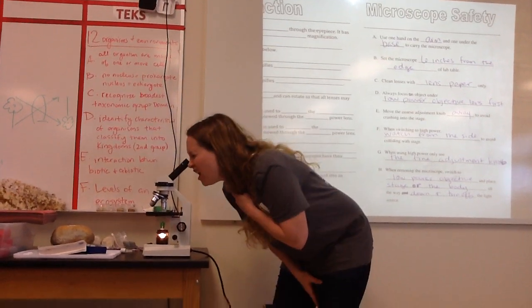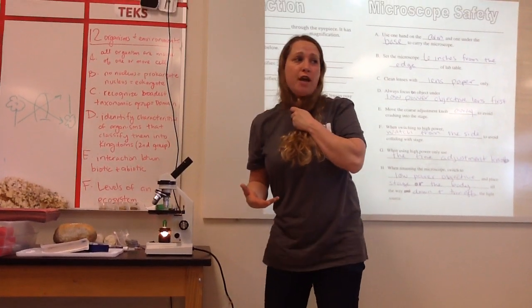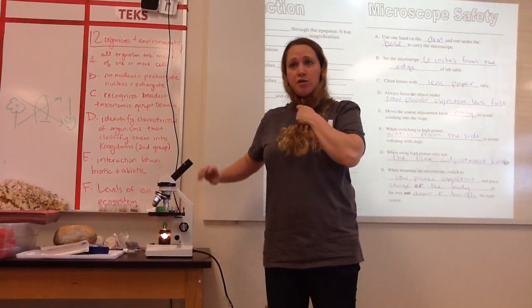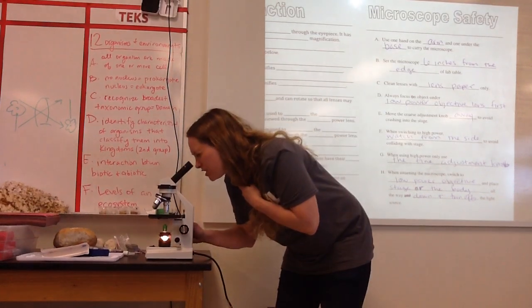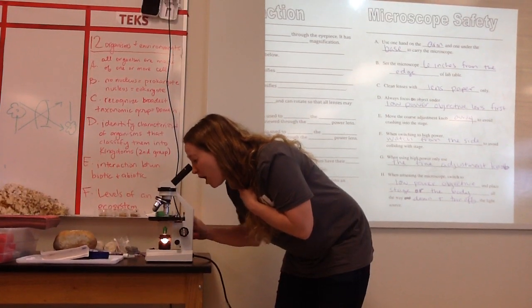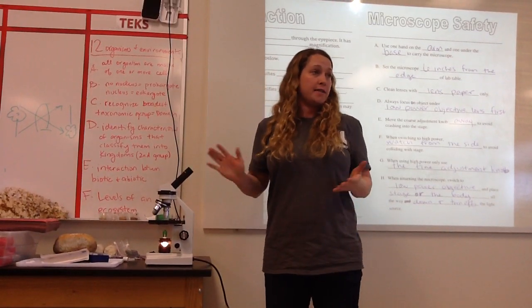So I put my eye on. I don't see anything really clear, so I need to see if it's still there. I'm going to take my knob. Can I just go forward and get close again? No, I can only back up. So I'm going to back up and see if it's still there. Back up, back up. Oh, and now it's in focus really well. So I don't need to do anything, okay? I can see it. I can draw it.